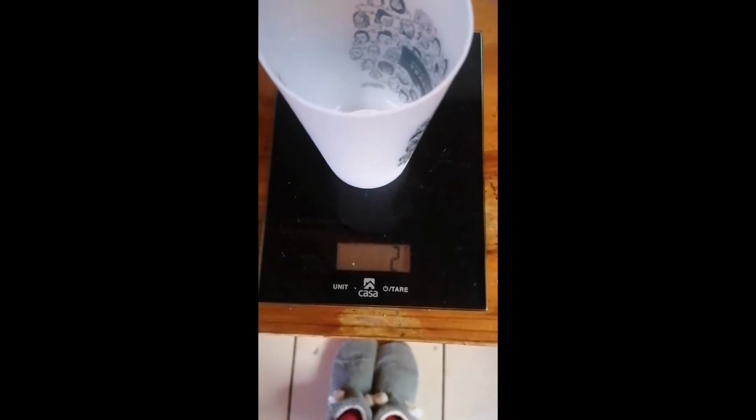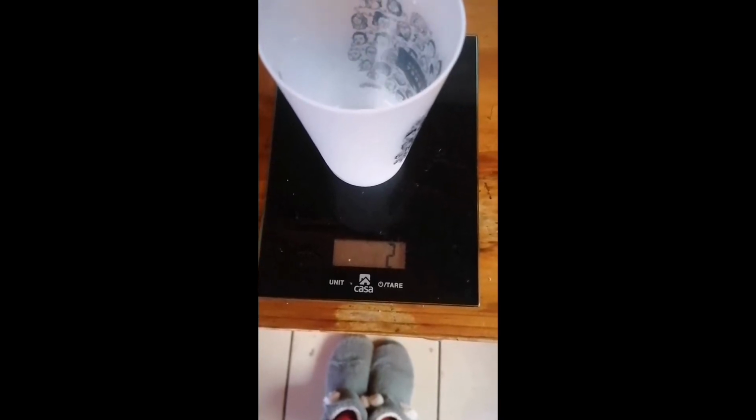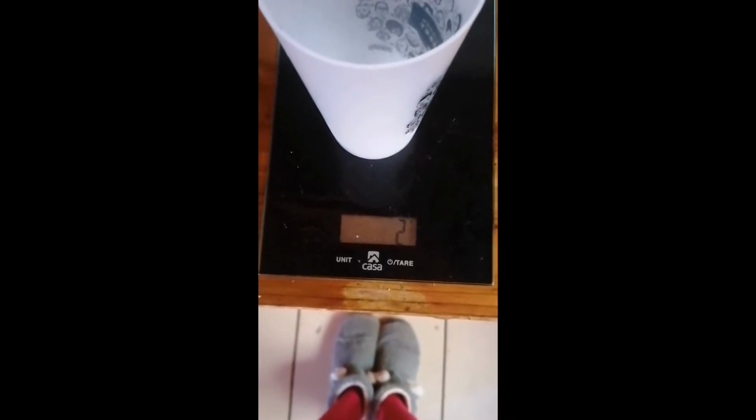So let's quickly look. Okay, so we have 5 grams of agar powder, and I'm putting it into a cup. It's a bit of a struggle, but I have cute slippers, so let's keep watching them.